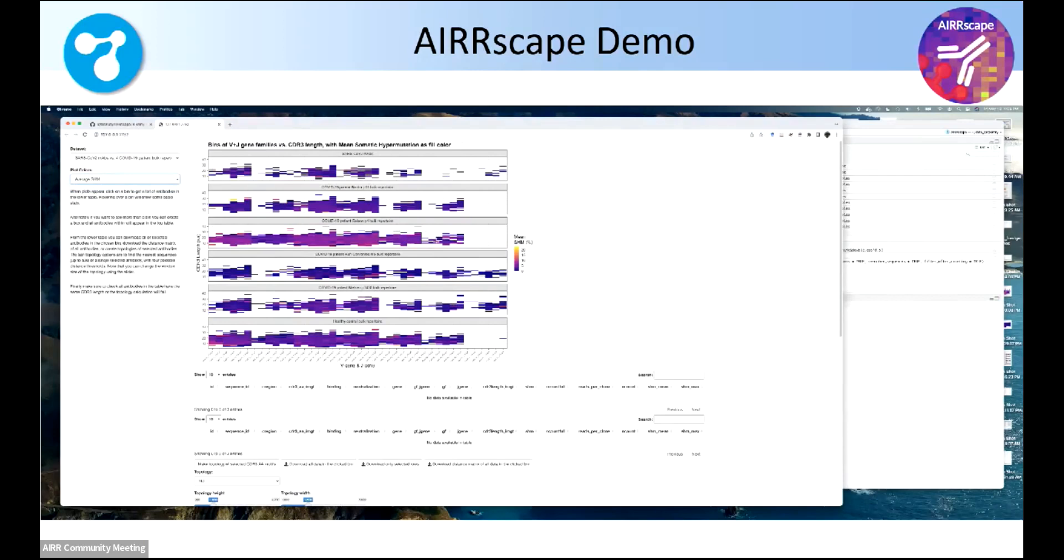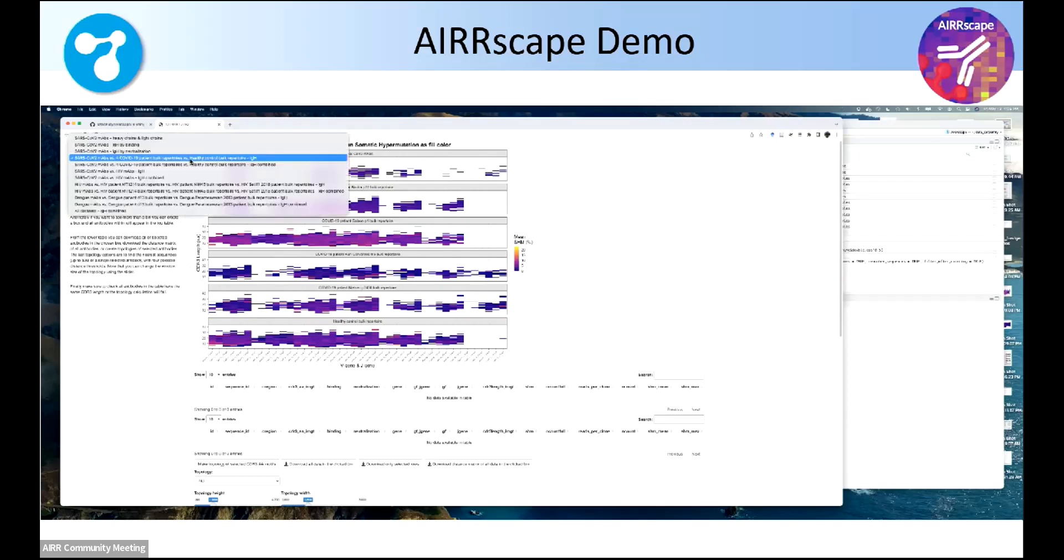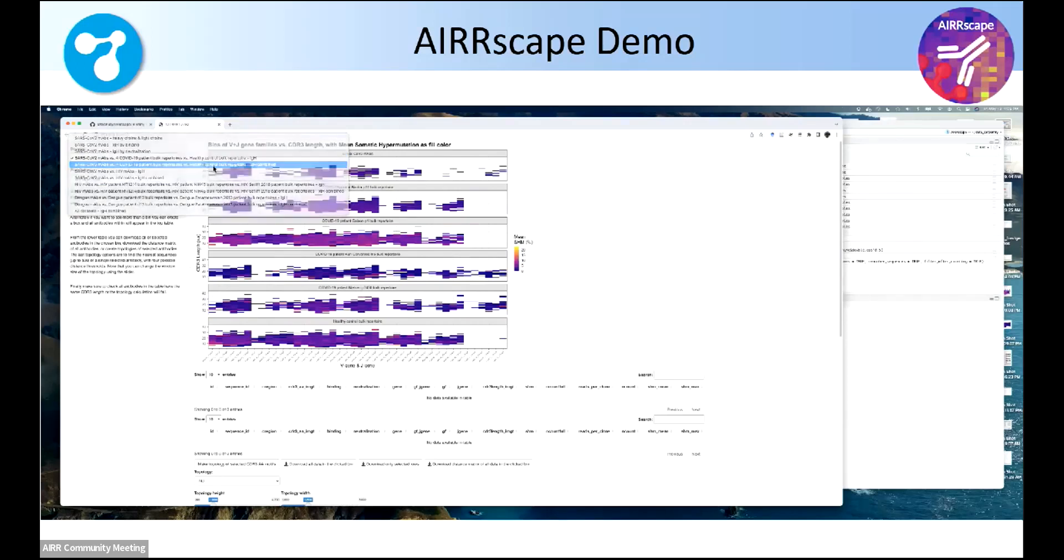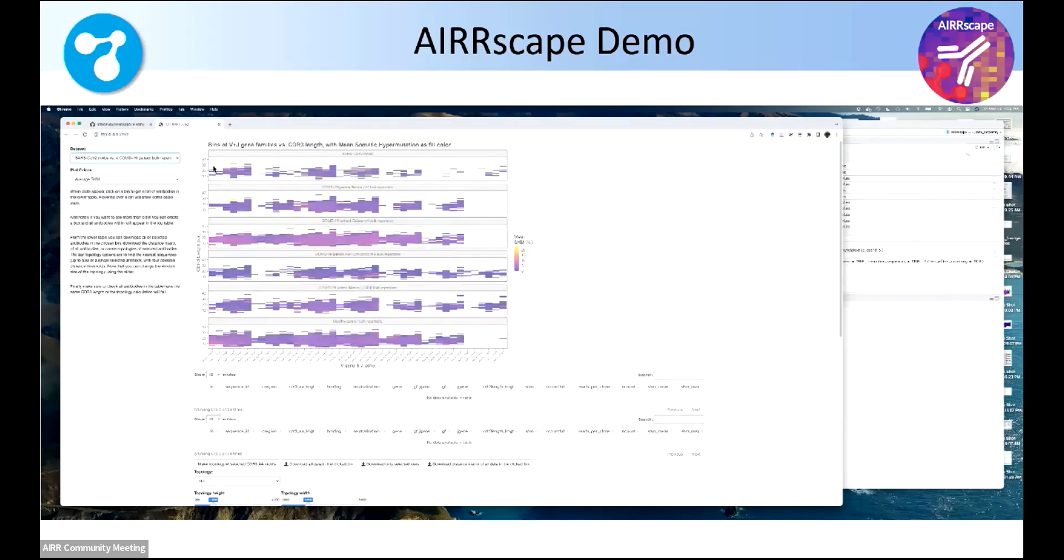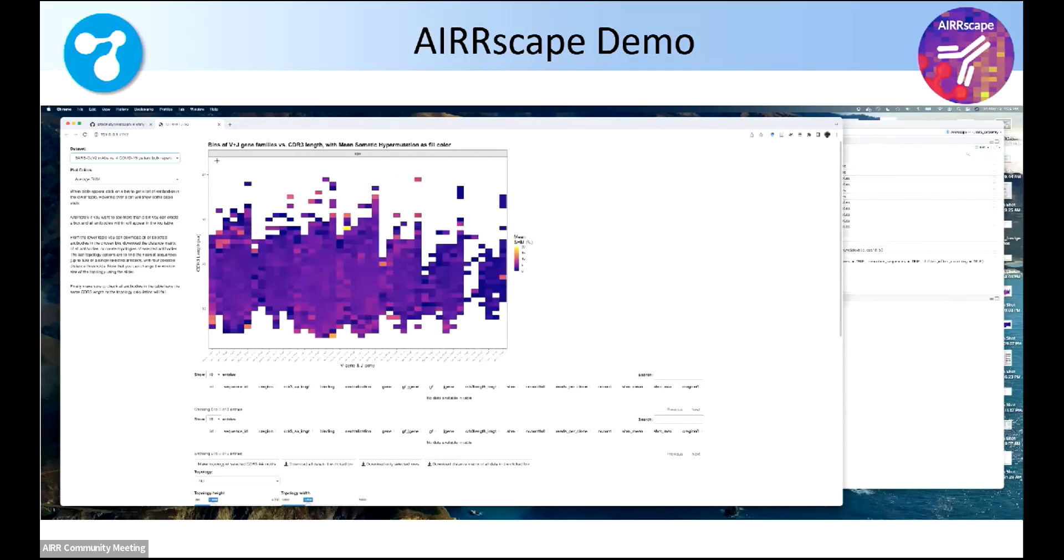So for this, this is a SARS-CoV-2 example. The top one is the COVE-AB-DAB database, which is really great, made by the Oxford Protein Informatics Group. There are four different patient bulk repertoires from four different studies that we just grabbed as examples, and the bottom one was a healthy repertoire. So you can compare all of those at a very high level, or you can combine them into one view, and this is really great for looking for convergence.